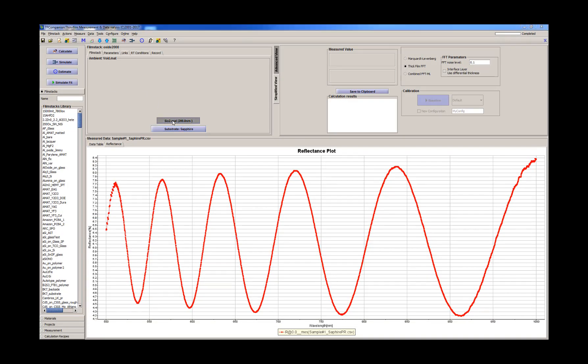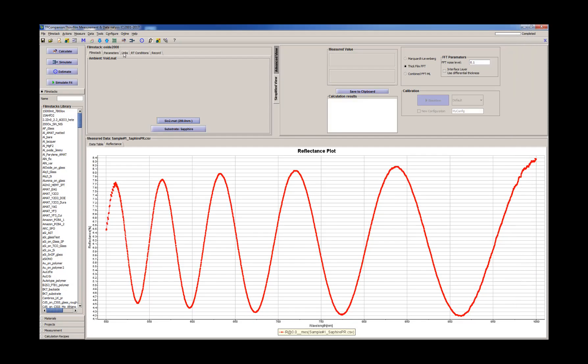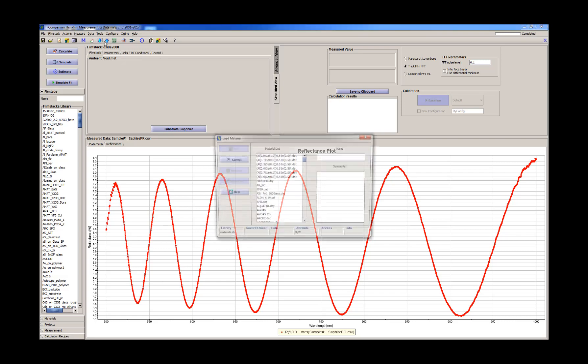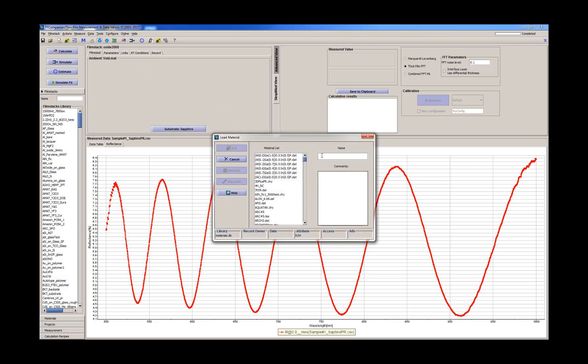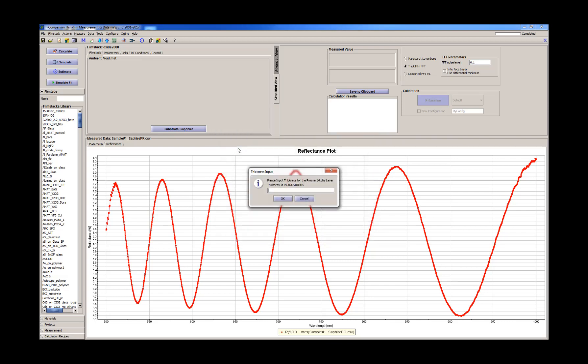So we changed the substrate and now we need to change the layer. Actually we can do it differently. We'll just remove the layer and add the layer photoresist. We don't have optical constants of the photoresist, so we'll just use the polymer and we'll give it one micron.